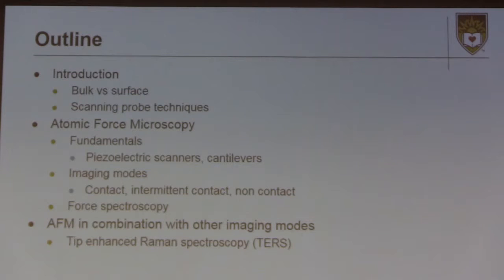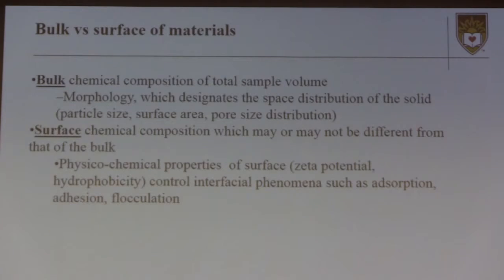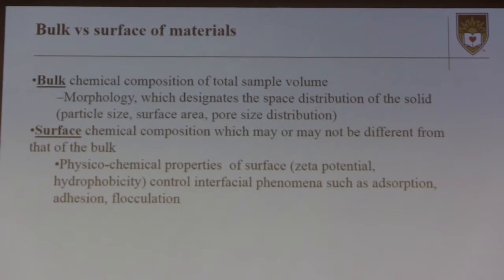For example, tip enhanced Raman spectroscopy. I think it's very relevant to this talk. So, let me tell you what you probably know already, right? What is bulk versus surface?